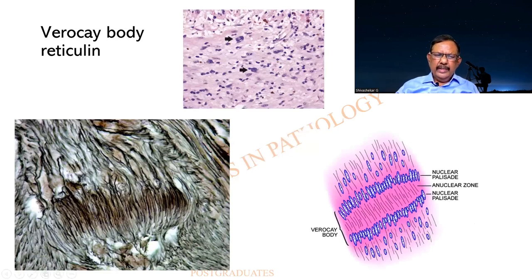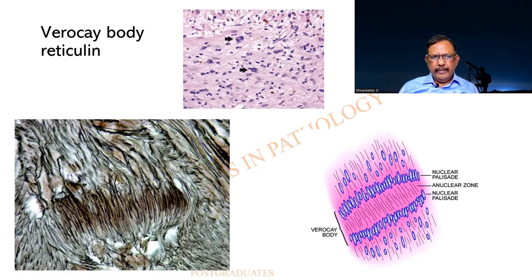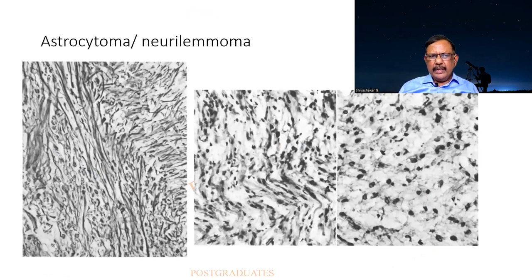Yet another use: there is a Verocay body here with a palisading arrangement of nuclei. Always in a schwannoma, there is a cellular and an acellular area — the cellular area is what we see on either side, and there will be a relatively acellular area where there are sparse lymphocyte-like cells dispersed. Look at the excellent reticulin framework that has been brought about by this stain. Sometimes there can be an astrocytoma having a similar picture, and it will be difficult to make a diagnosis of whether it is an astrocytoma or a schwannoma — both can occur in the brain. And the reticulin brings out the framework — the diagnosis of schwannoma.